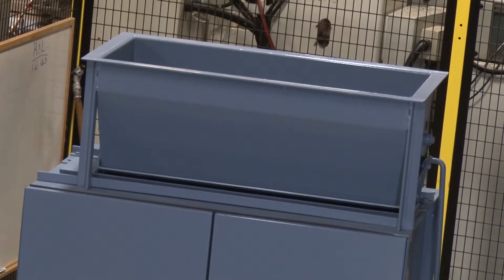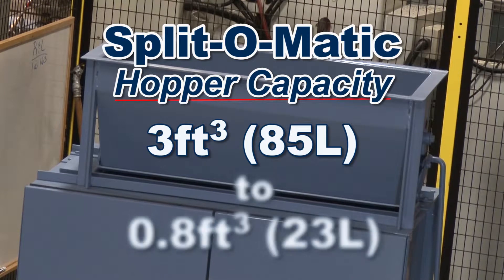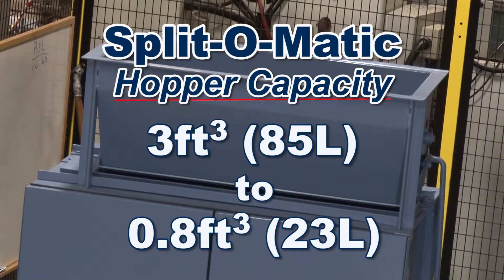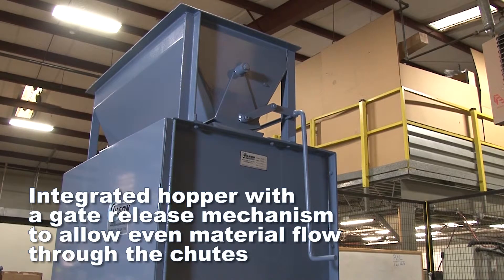Splitmatic splitter models have a hopper capacity range from 3 cubic feet to 0.8 cubic feet. These integrated hoppers with their hopper gate release mechanism allow for proper loading of the bulk sample to ensure even material flow through the chutes.